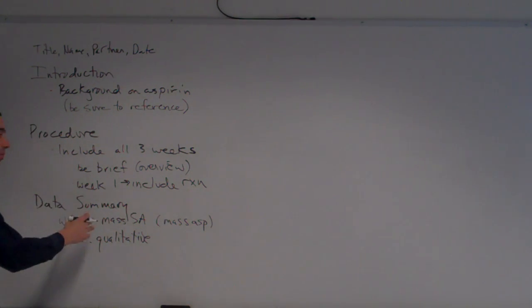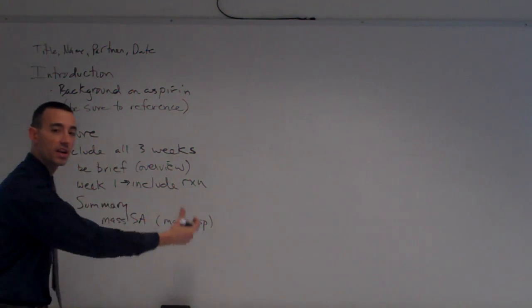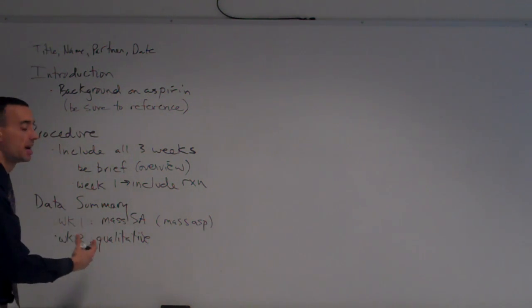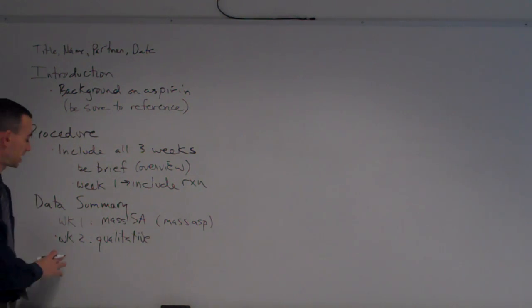Okay? Melting point, they give the melting point range. Iron 3 chloride, they give the iron 3 chloride color. All right? So there are ways that you can take qualitative information and put it into a nice summarizing table that makes it quick and easy to see and read. You could also give bullet points perhaps for each of the qualitative tests as the results. Okay? Or sorry, as the data at this point.